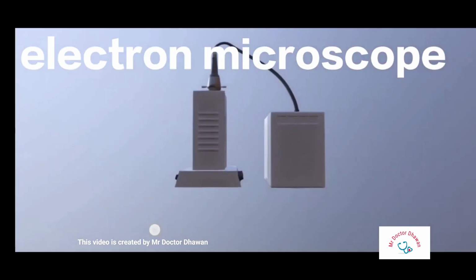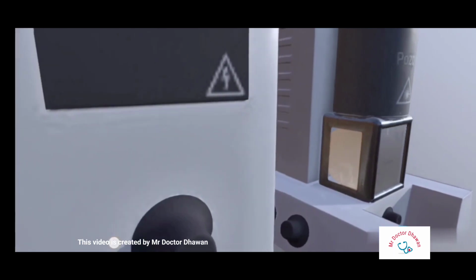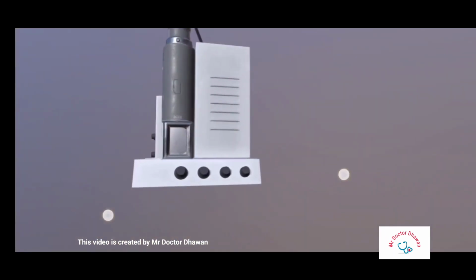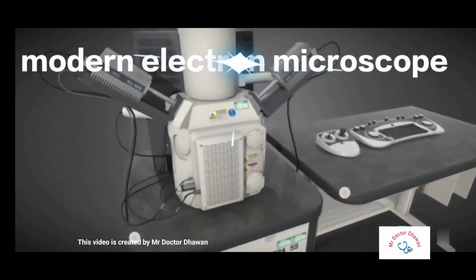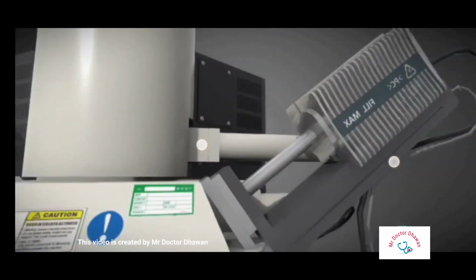The electron microscope. Resolution is the limiting factor to a light microscope, since the greater the magnification is, the less it is able to resolve the image. At magnifications beyond 2000x, the image becomes blurry, but electron microscopes can be used at greater magnifications.